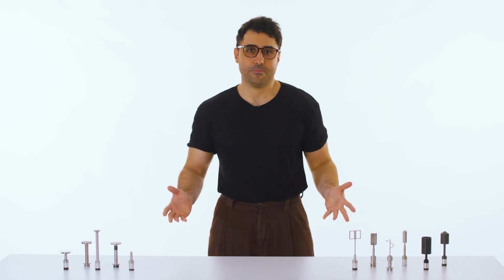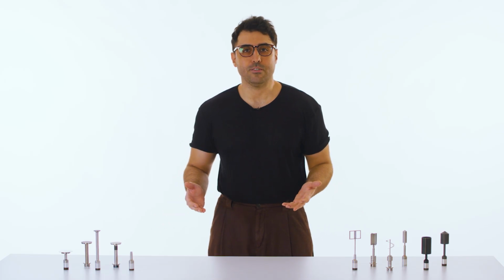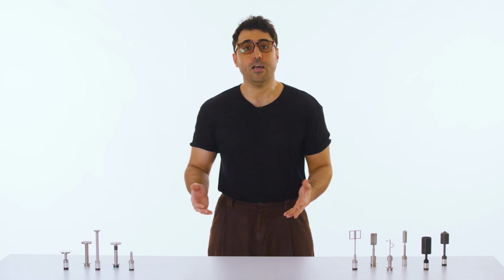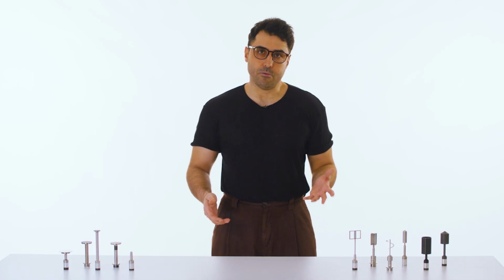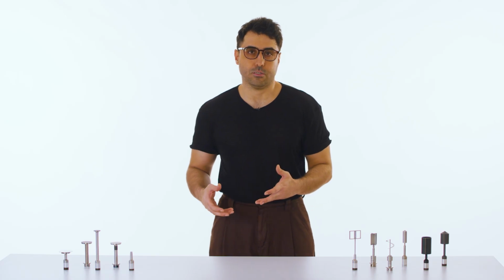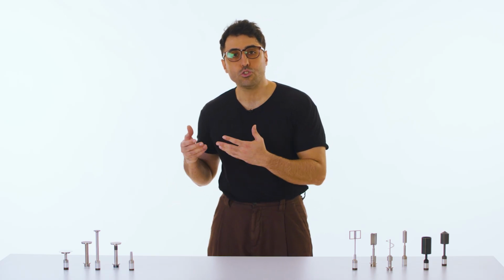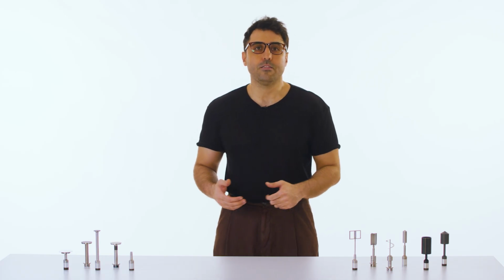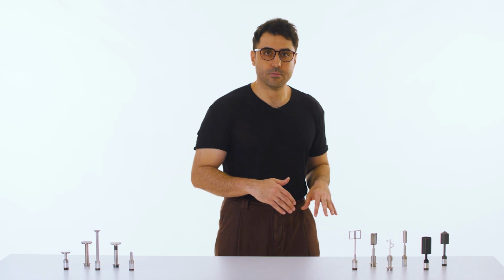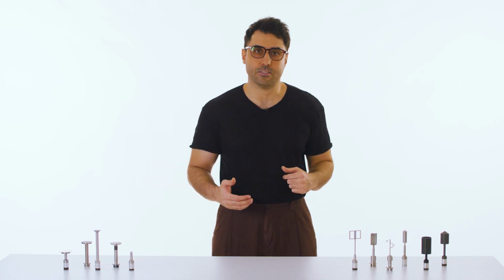Why? Because during the ramp up, the microstructure is still intact. It needs time to break. So at low shear rates, the shear stress or viscosity appears higher than its true steady state value. But during the ramp down, the structure is already broken from the high shear rates.